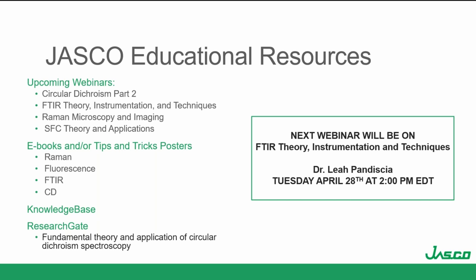We have another question. We are not sure if VCD could provide valuable information on our sample. Is it possible to get a sample run to test it out? Yes, if you want to send samples to our lab, you can contact us, any of us. You can contact me, and I will give you all the instructions to send the sample to the lab. Usually what we do is run the samples and then have a conference call with a report where we explain what the findings are. Of course, the more information that you provide, the easier it is for us to do the measurements.